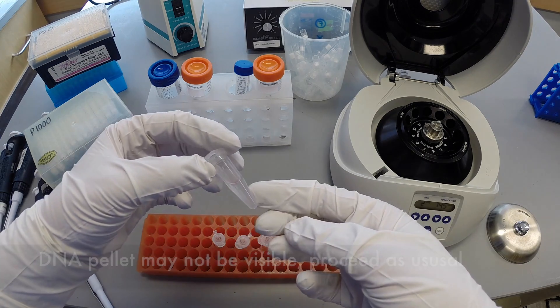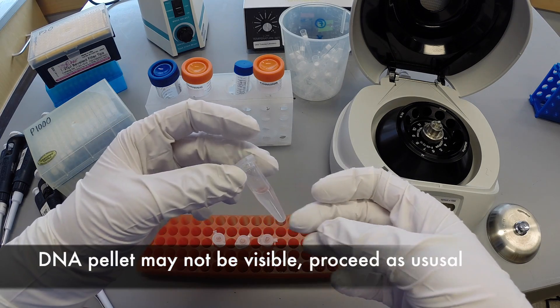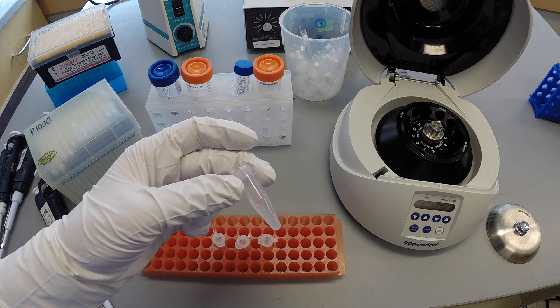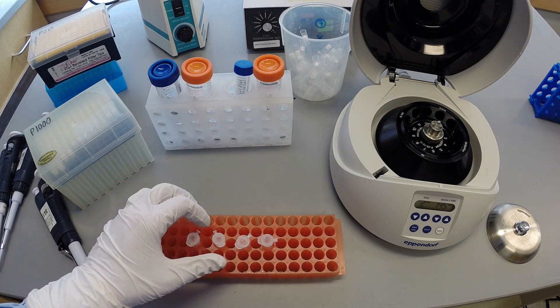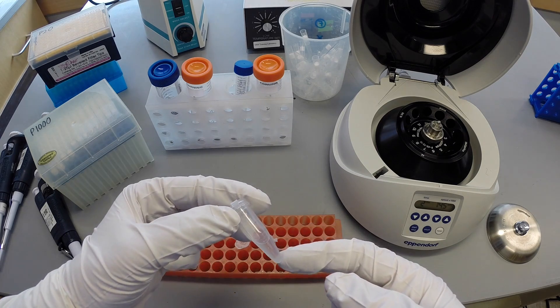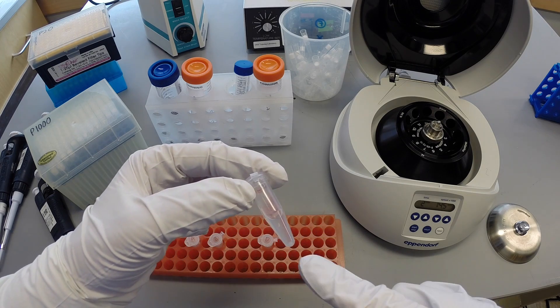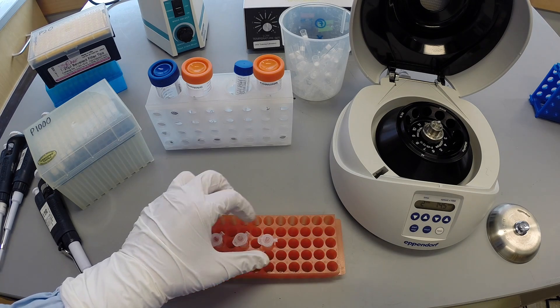Visually inspect for a pellet at the bottom of the tube on the side of the hinge. A pellet is not always visible, so you can choose to centrifuge again or proceed as normal. In this example, a pellet is only seen in samples C and D, but all samples are carried through the process.